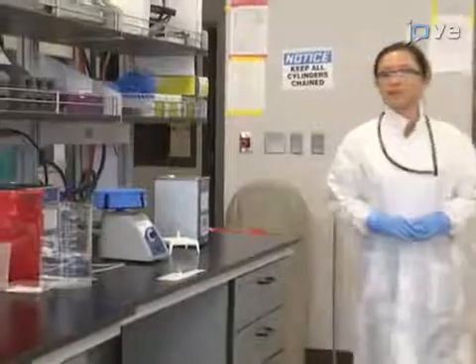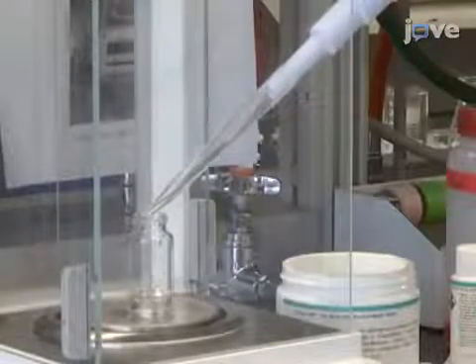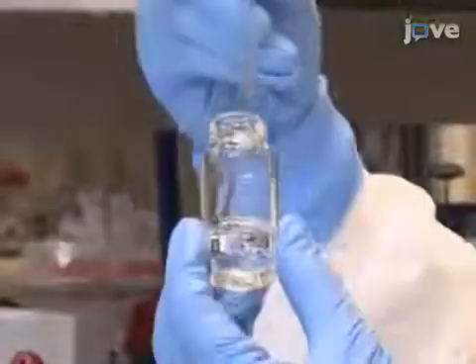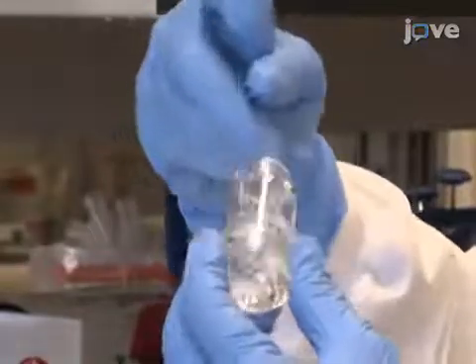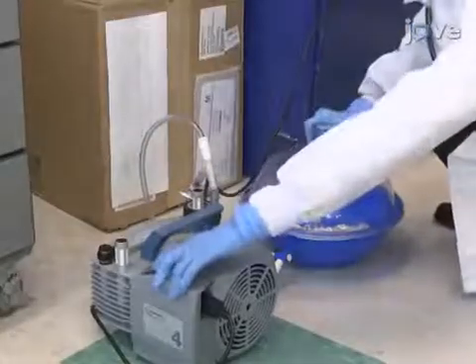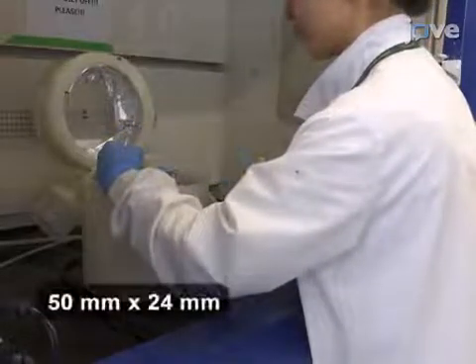To prepare elastomer-coated cover slips, first mix Sylgard 184 curing agent with base solids at a base-to-curing agent ratio of 55:1 until it is homogeneous. 6 grams in total are needed. Next, degas the solution. Then use the solution to coat the cover slips on a spin coater.